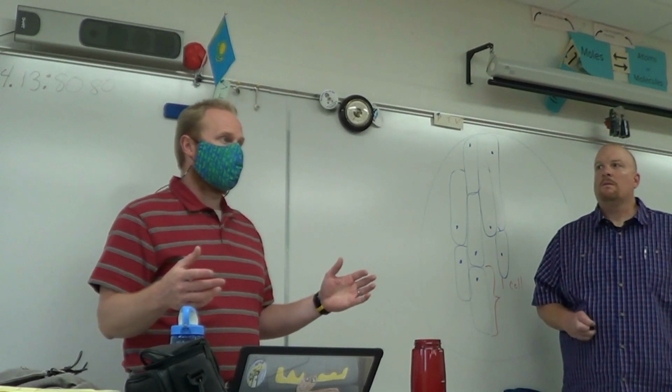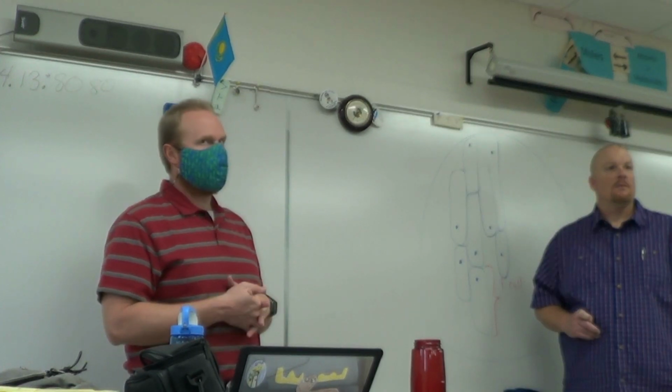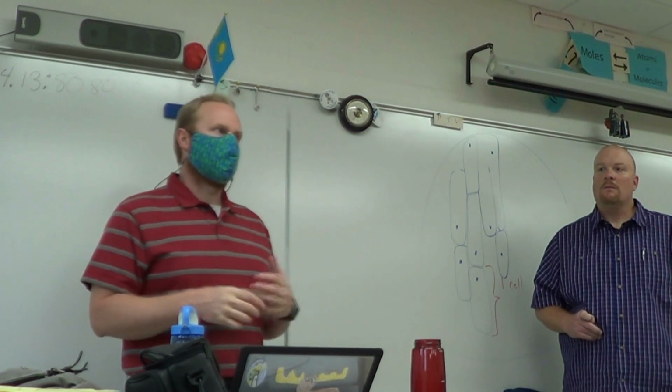So if you have questions along the way, we are fortunate to have 24 microscopes in this classroom. That gives you the opportunity to have your own scope and not have to wonder when it's your turn. Everyone gets to take a chance if you want. Because we have less than 24 students, it looks like in here, everyone gets the opportunity to scope it out.